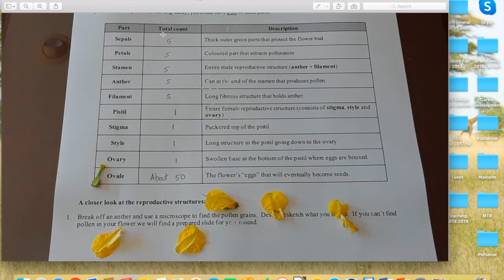The bog bean has, by my count, 5 sepals. Those are the green sort of spiky things, although the sepals on your plant might look totally different. In fact, your flower might not even have sepals. It has 5 petals. There they are at the bottom. Having cut away the petals, if you look at the stamens in the middle, it also has 5 stamens.